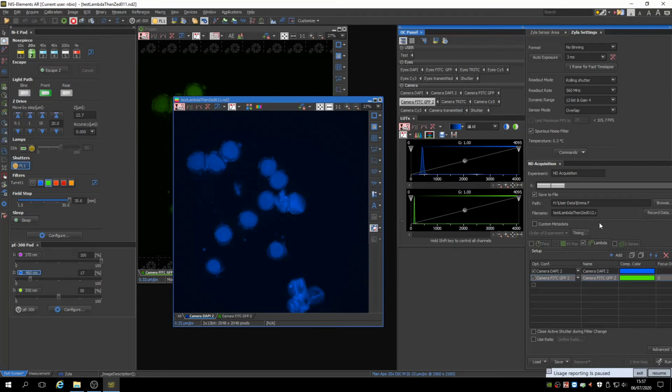If you have an uneven sample, you may struggle to get all of your sample in focus at the same time. You can overcome this by doing a Z-stack. A Z-stack takes images at multiple focal planes. This technique is also used for 3D imaging, but if you require an accurate 3D image, we would recommend that you switch to a confocal microscope instead.